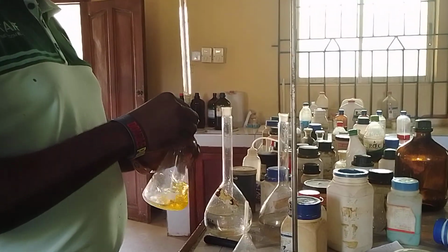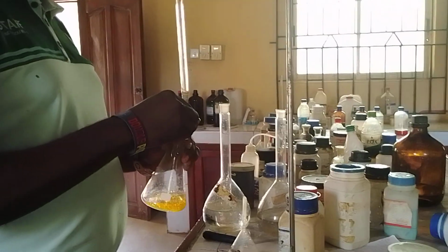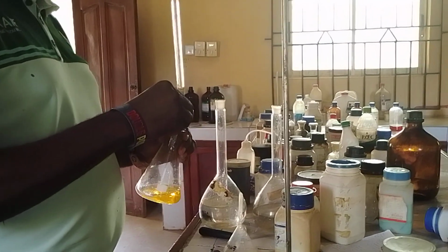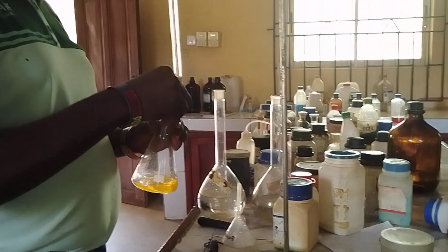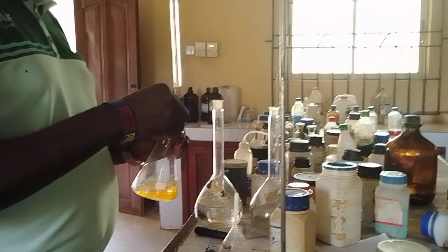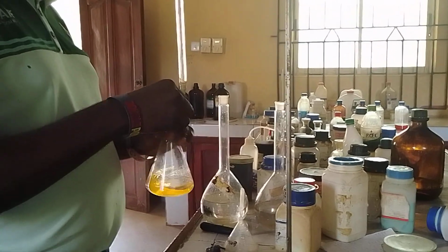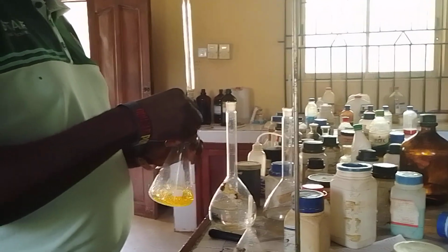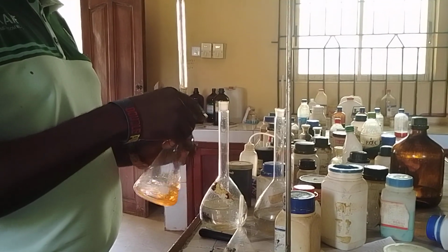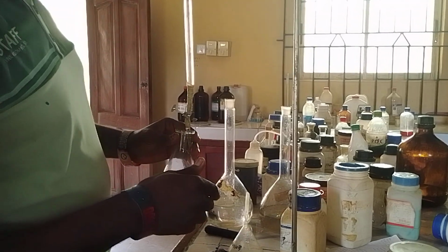The reason I have to shake is to hasten the rate of chemical reaction by making the reactant particles to be at close contact. It's about to change now. Yes, it has changed. So I want to check.